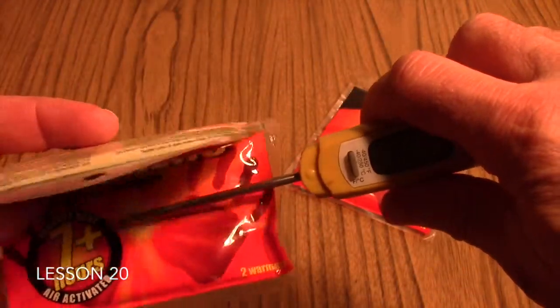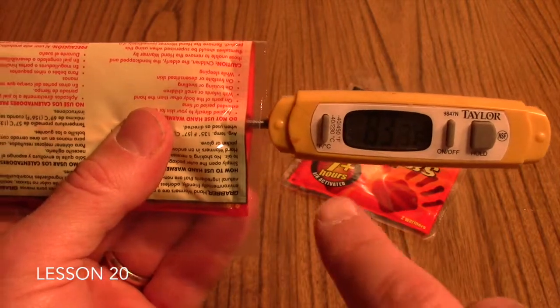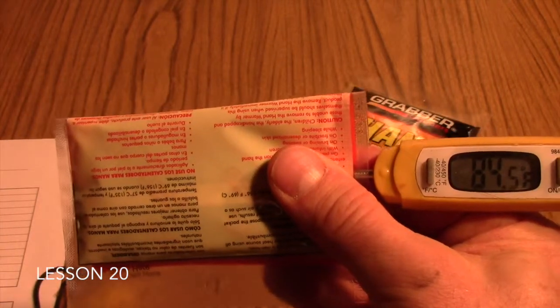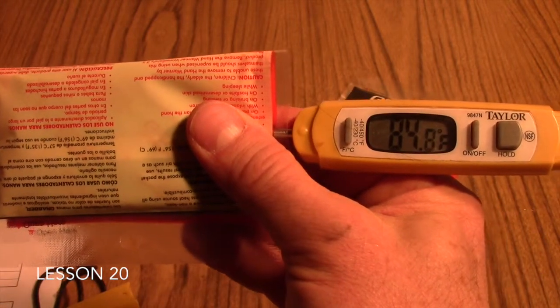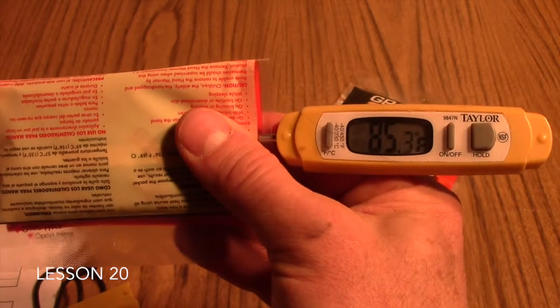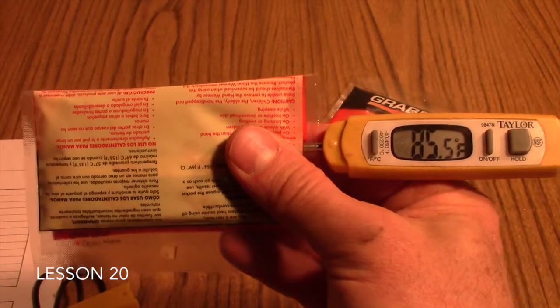So what we're going to do is before we do that, we'll just get a starting temperature here on our pack. Then we'll go ahead and activate the pack, and then at certain time increments we'll take a temperature reading. So you can decide if you'll do it every 30 seconds or every minute, or however. That can be something you can decide with your students on how often you take a temperature. Righty? And so you'll just continue that for as many trials as you like.